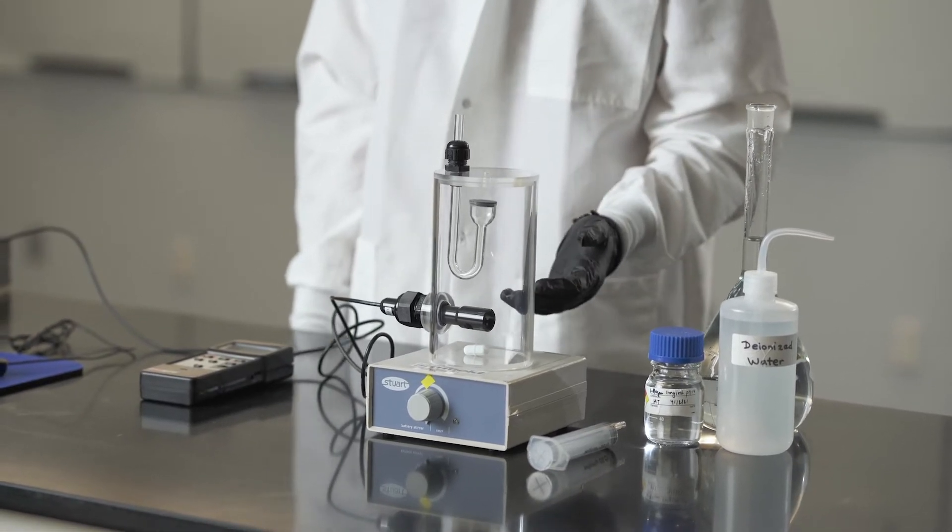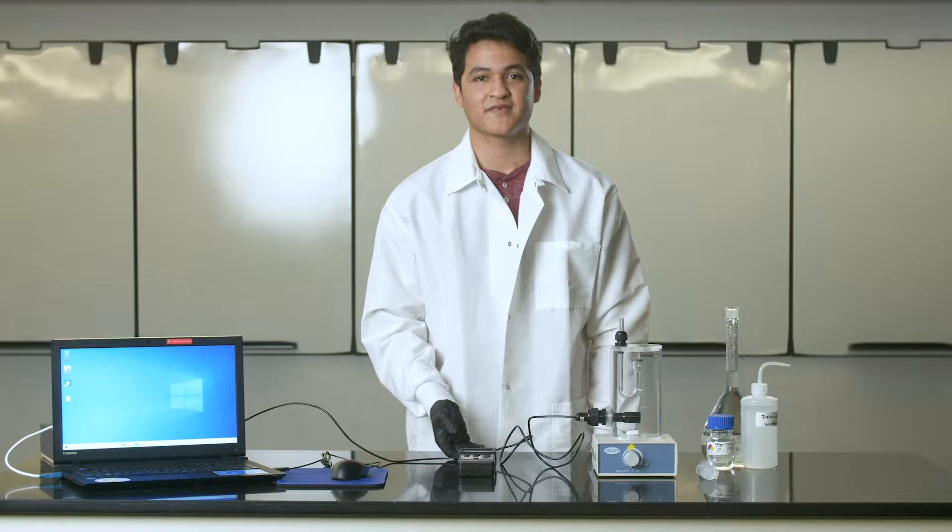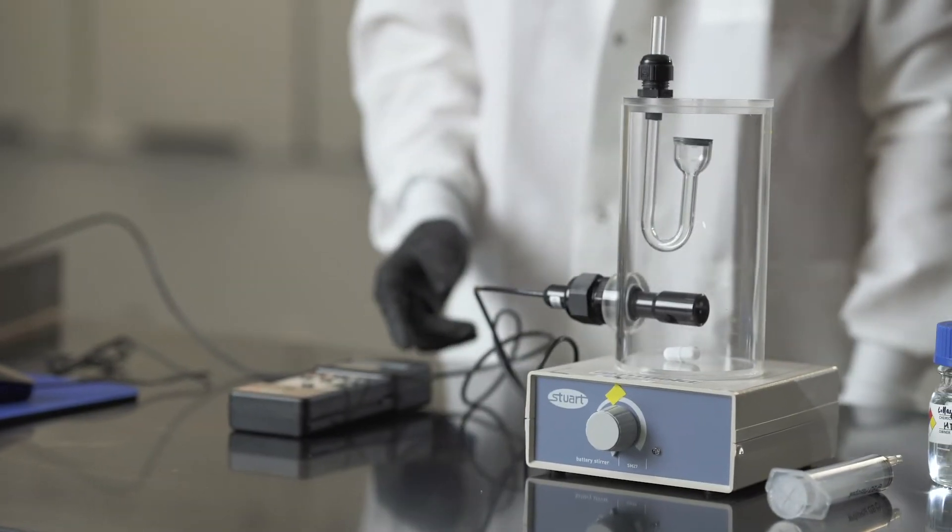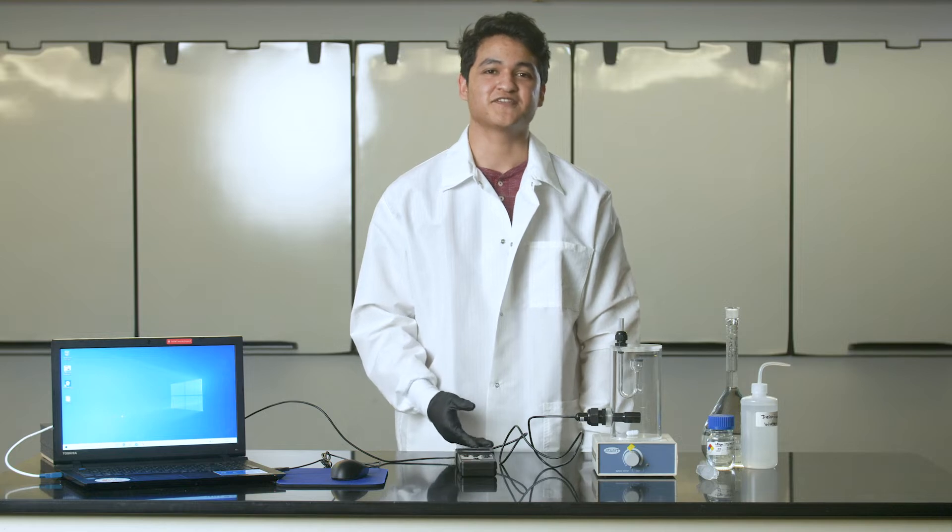The diffusion vessel is a clear acrylic container that is placed on top of the magnetic stirrer. A conductivity meter attached to the diffusion vessel measures changes in conductivity as a function of time.